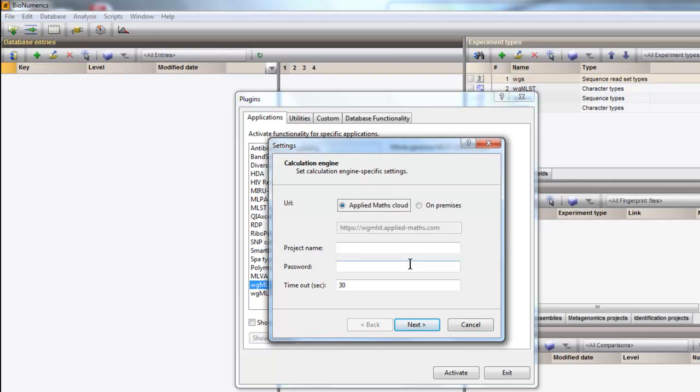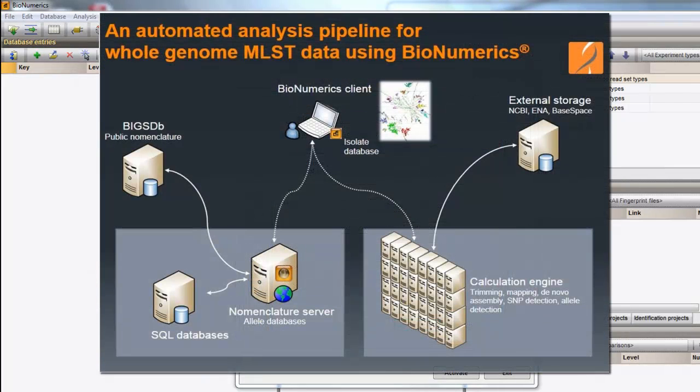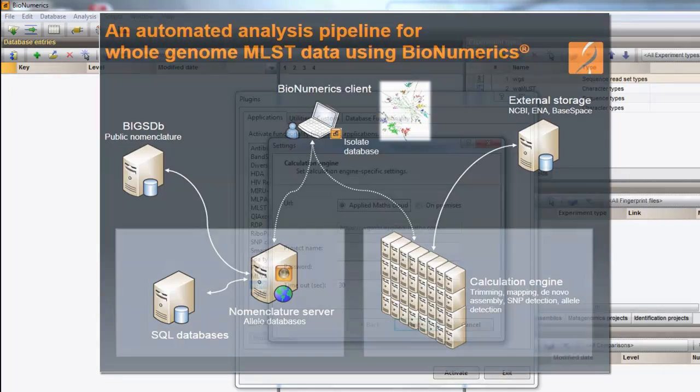This dialog prompts us for settings concerning the calculation engine. Demanding calculations such as de novo assemblies can be performed on an external calculation engine.